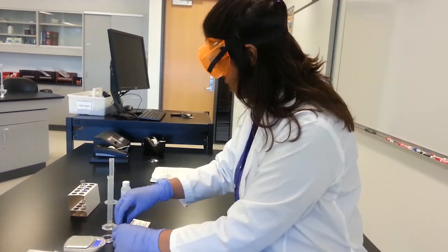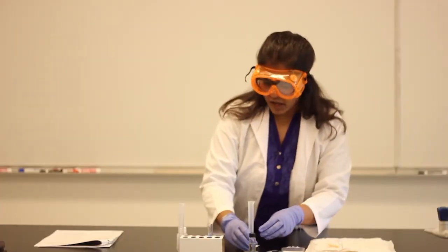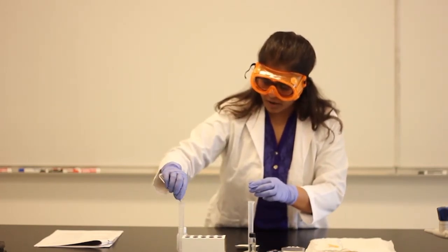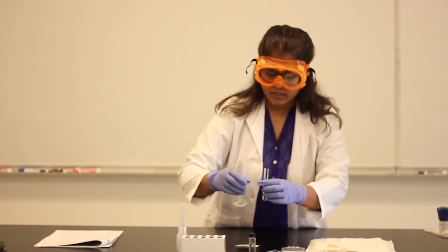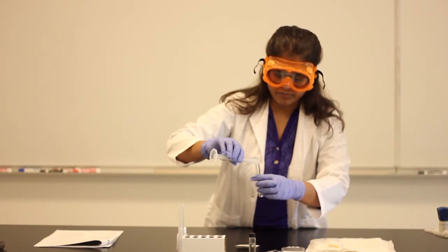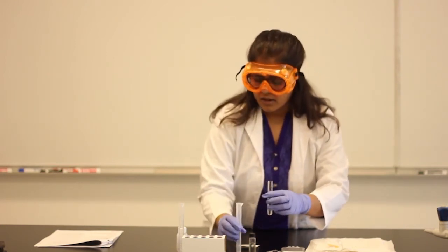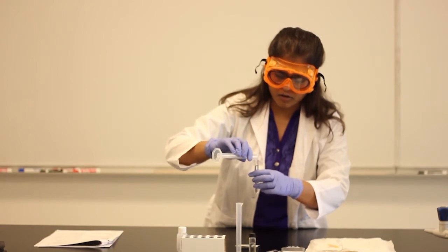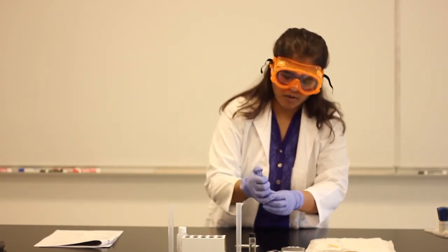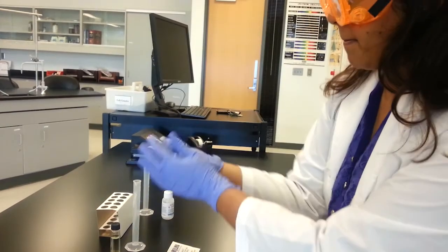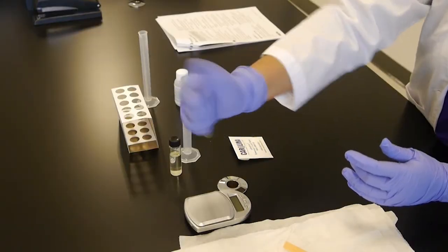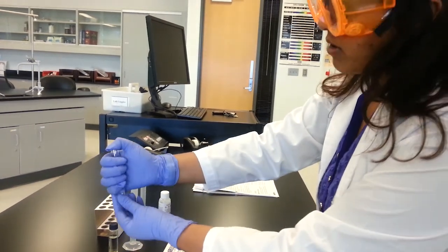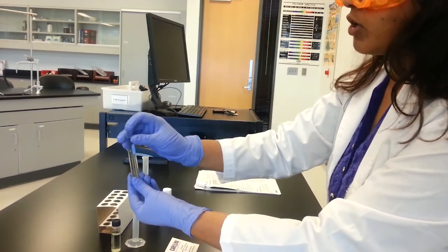Then what else we can do? We can see this biodiesel mixing with methanol, what would be the reaction? So I have here about 7 ml of methanol. Let's take this 1 ml of the biodiesel and mix it with methanol. Mix it well. Does it form any other layer or not? So mix it well. Make sure to write down what is your observation. Do you see any insoluble layer or not?